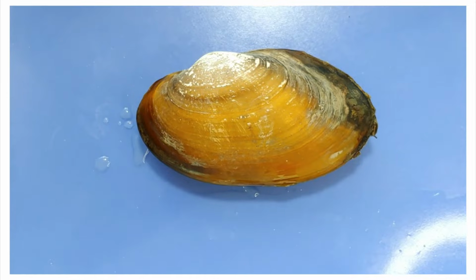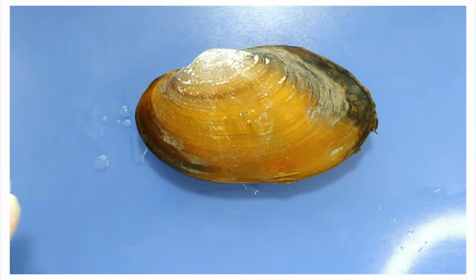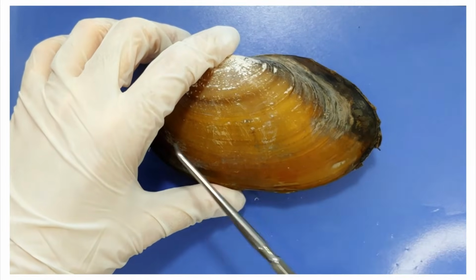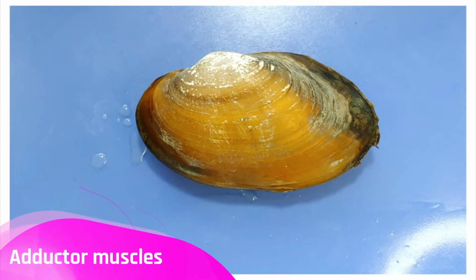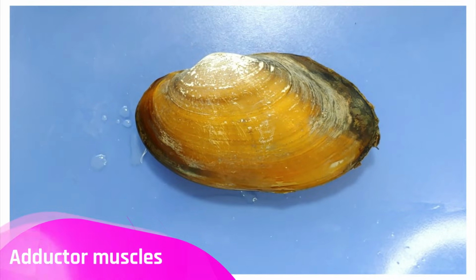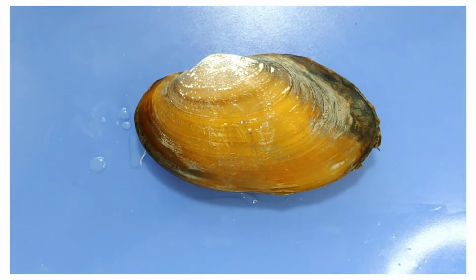Now I'm going to pry open the clam, and for that I'll have to cut through some tough muscles that keep the shells closed. Clams have two of these, one on each side, and they're called adductor muscles. These muscles help the animal clam up to protect itself from predators. Yes, I know that was a bad joke. No, I'm standing by it.